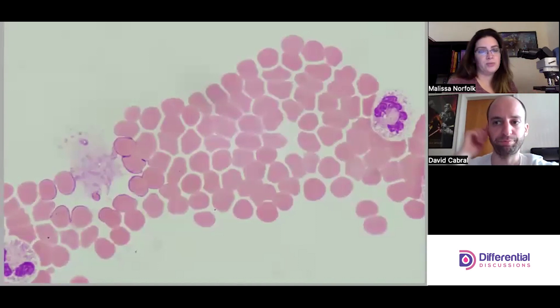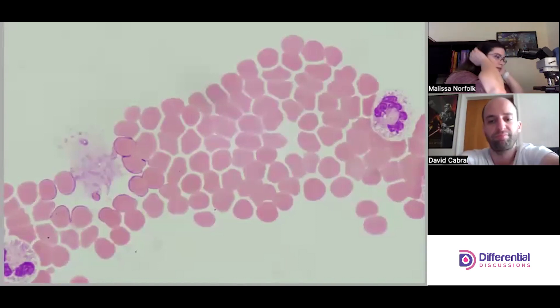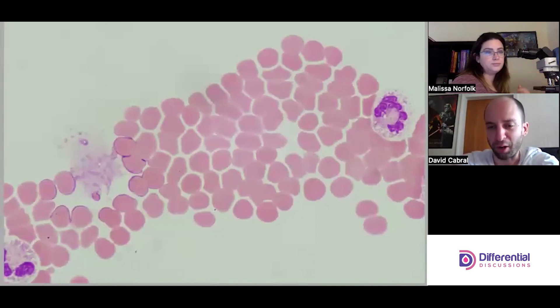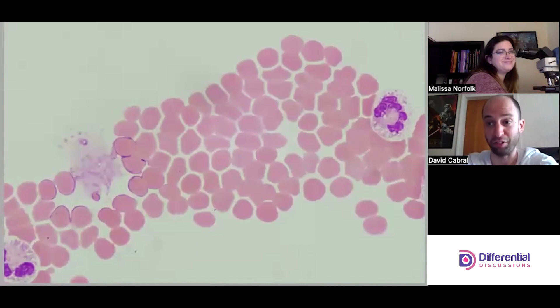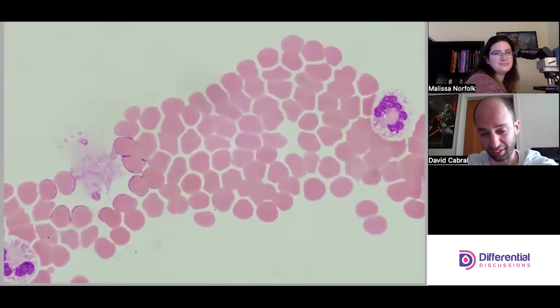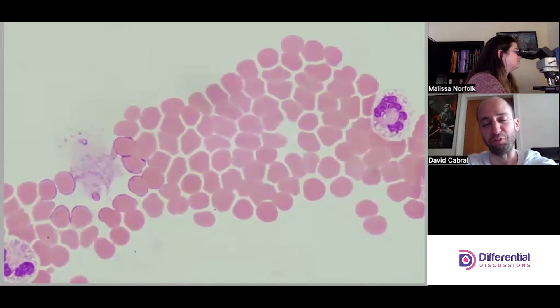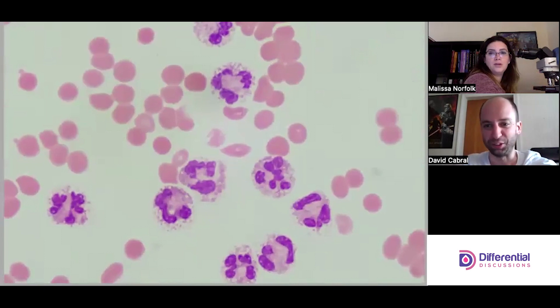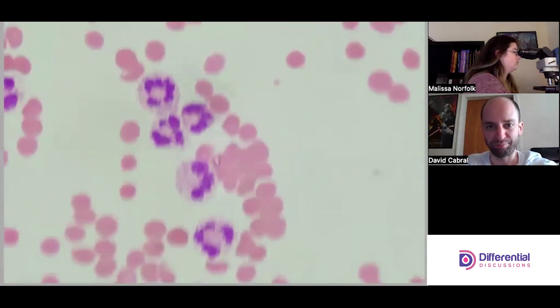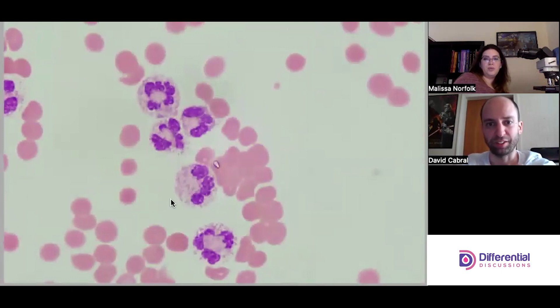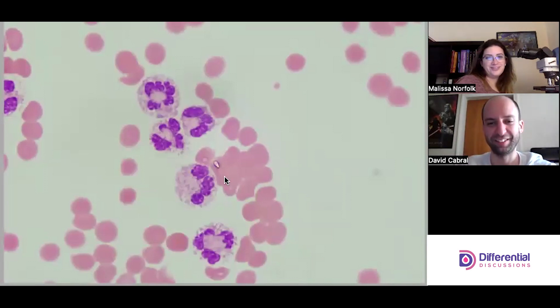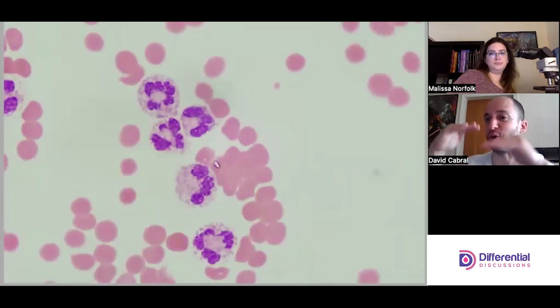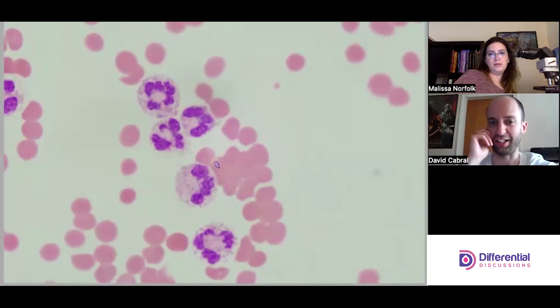We don't have that problem here — this is a wonderfully made slide. One of the things I took pride in is managing cellularity really well, because you don't want it to be too cellular. I just want to point out that this is not a crystal — it's just a watermark, a staining artifact. We can see that it's not in the same focal plane as the cells; it's kind of sitting on top.